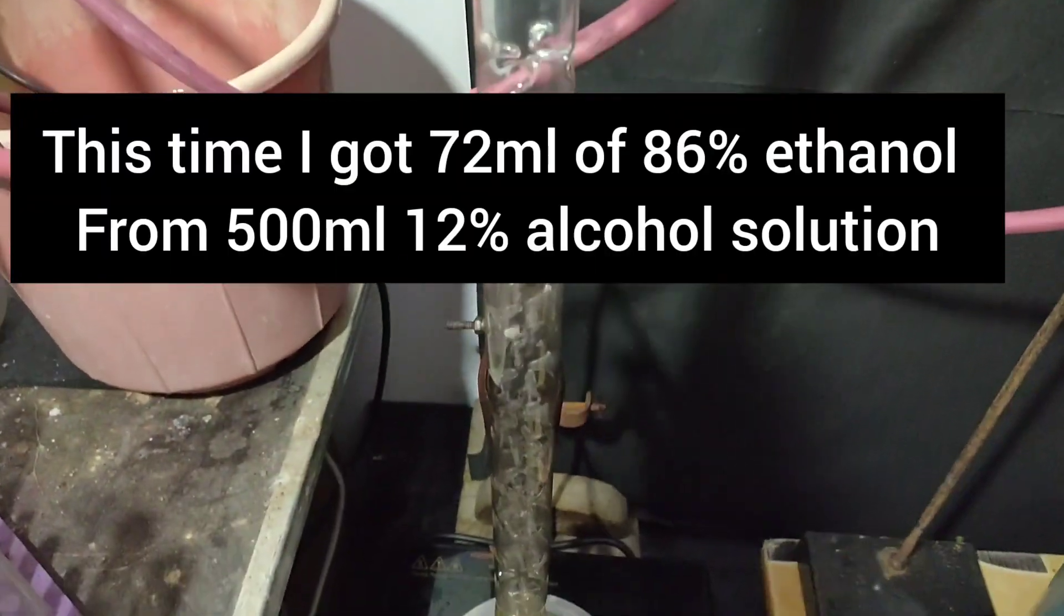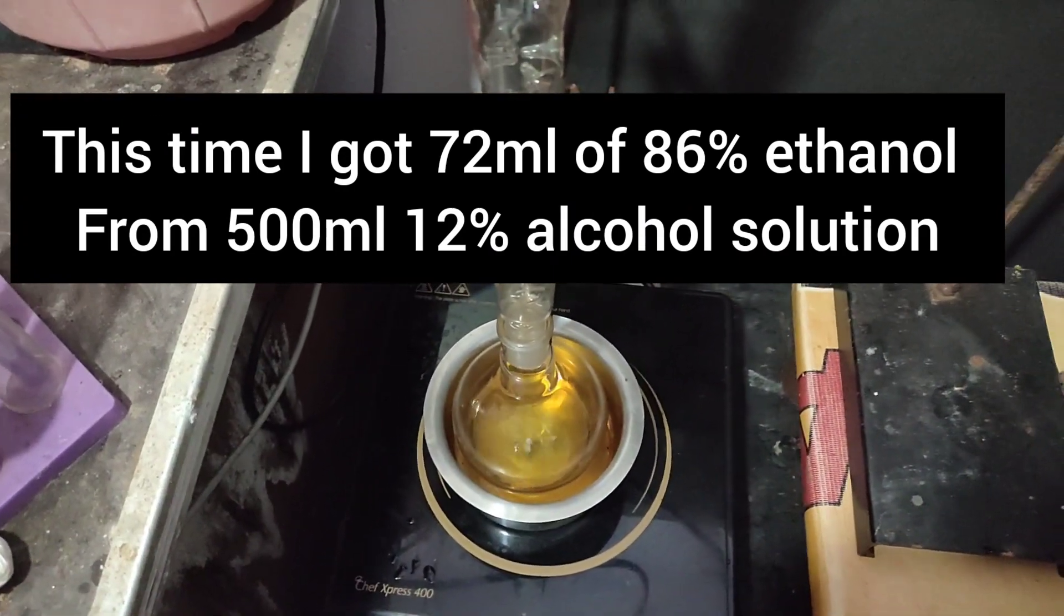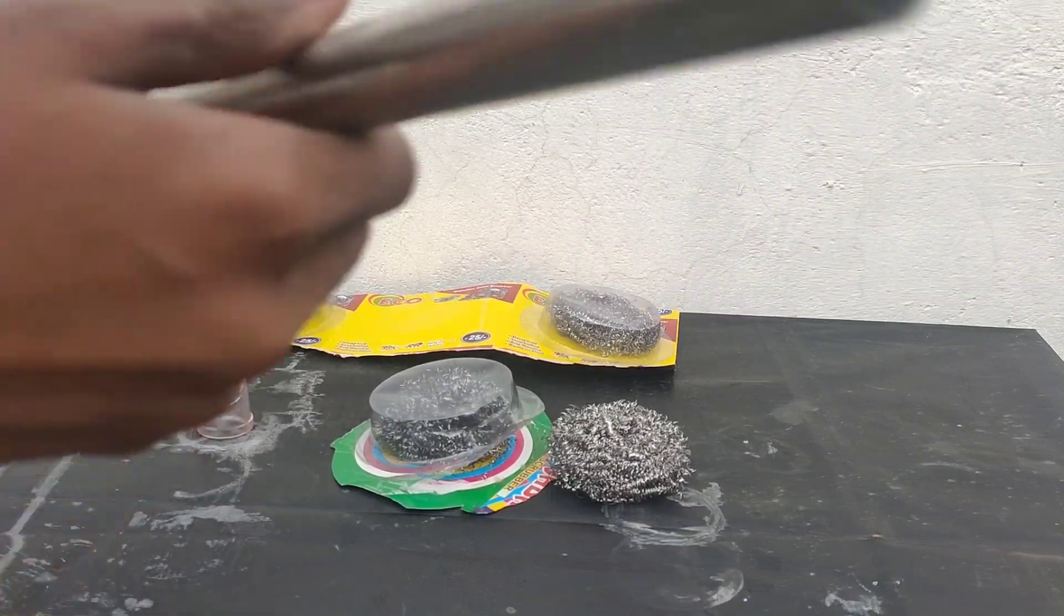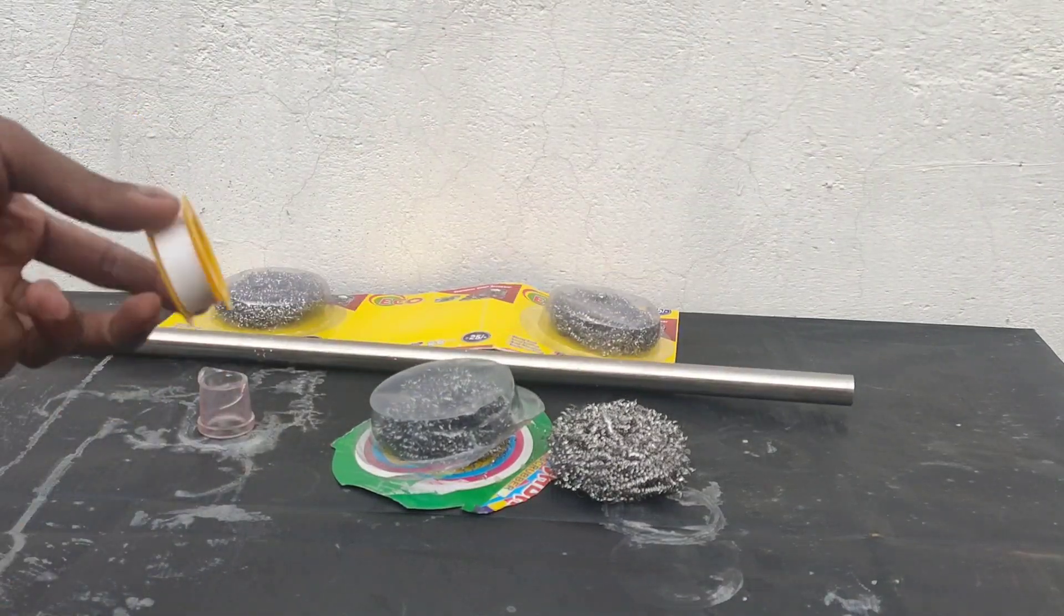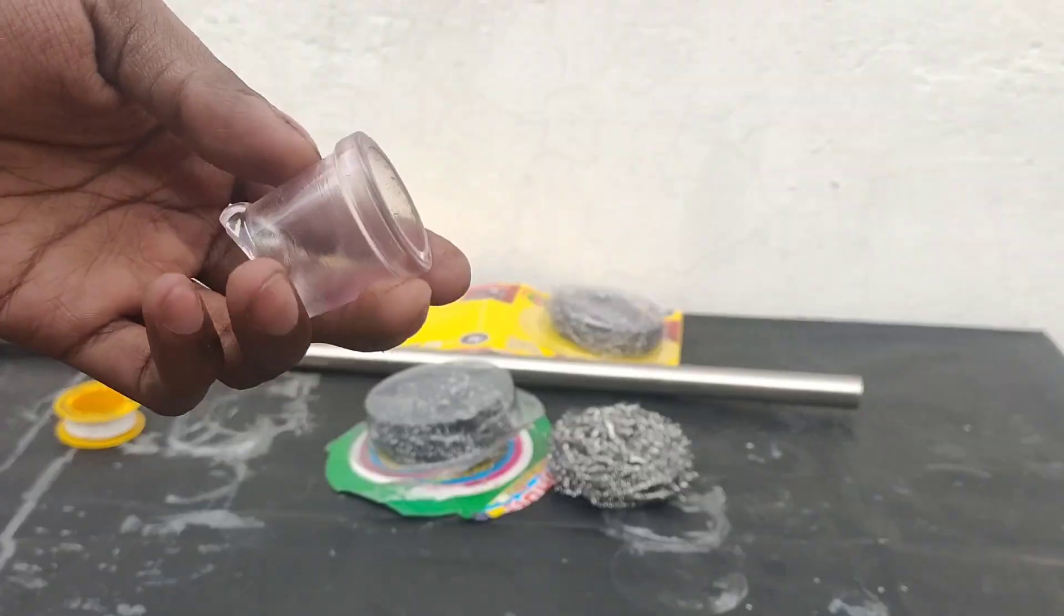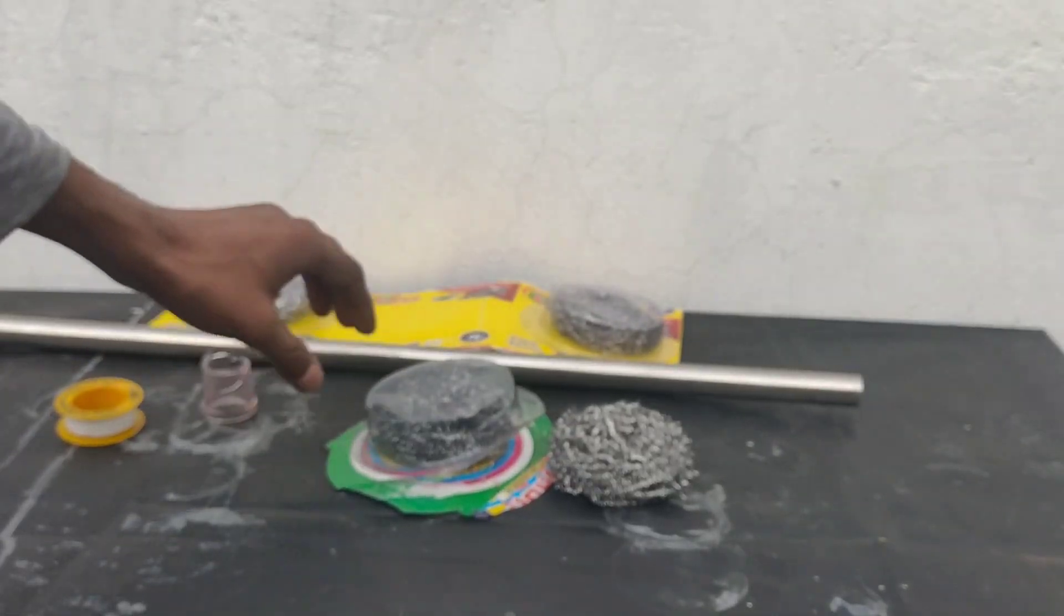I studied about fractionating columns and decided to make my own packed column. For that I took a steel tube 1.8cm in diameter, teflon tape, a B24 joint of a broken RB flask, and stainless steel scrubbers.